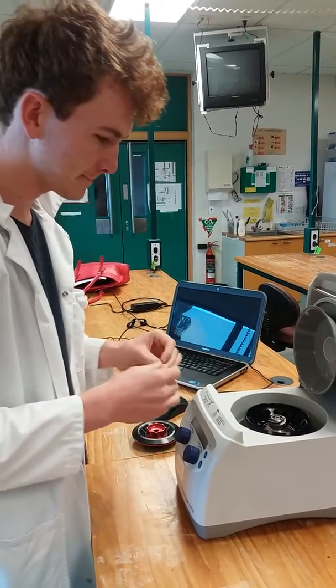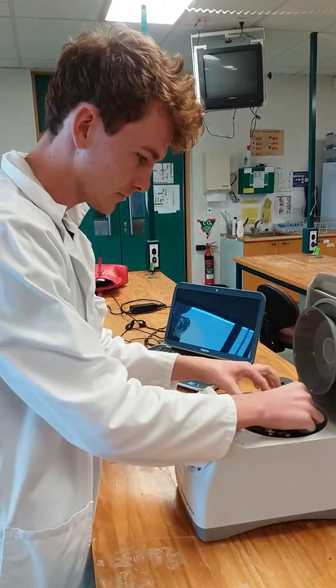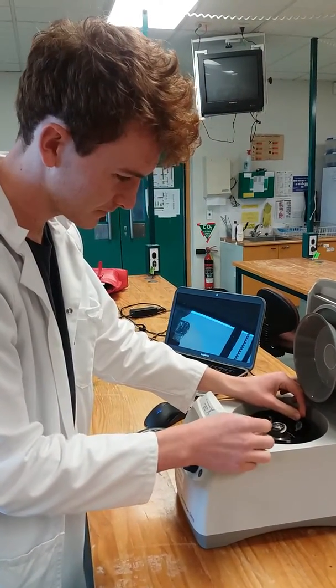Okay, so this is Theo setting up the centrifuge. He's got two samples. How does it work, Theo?